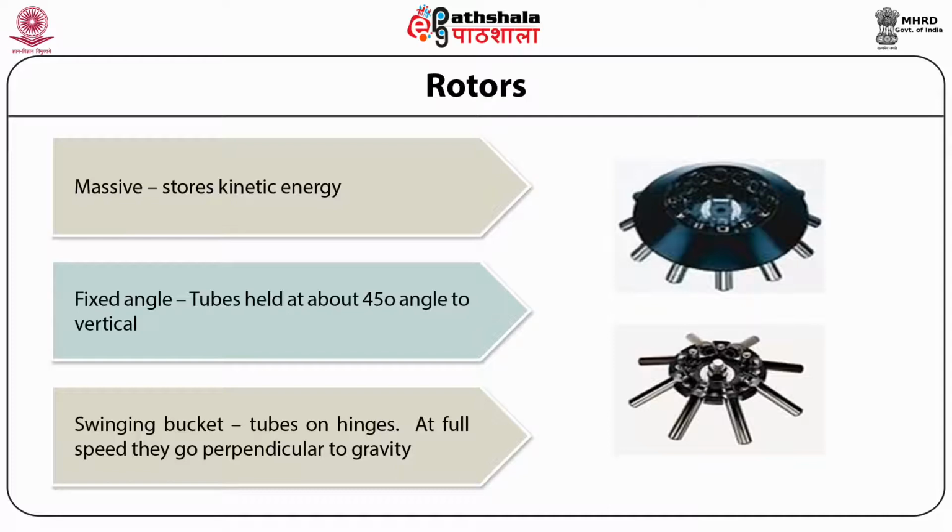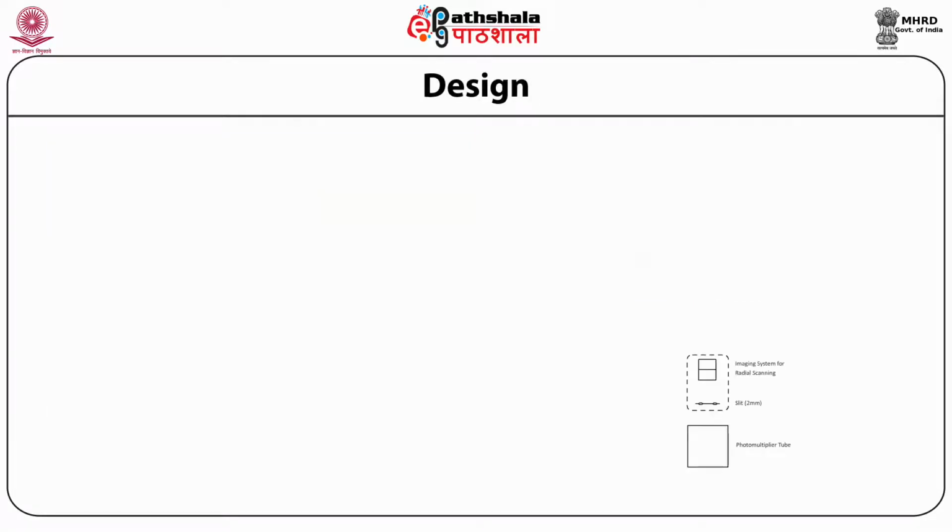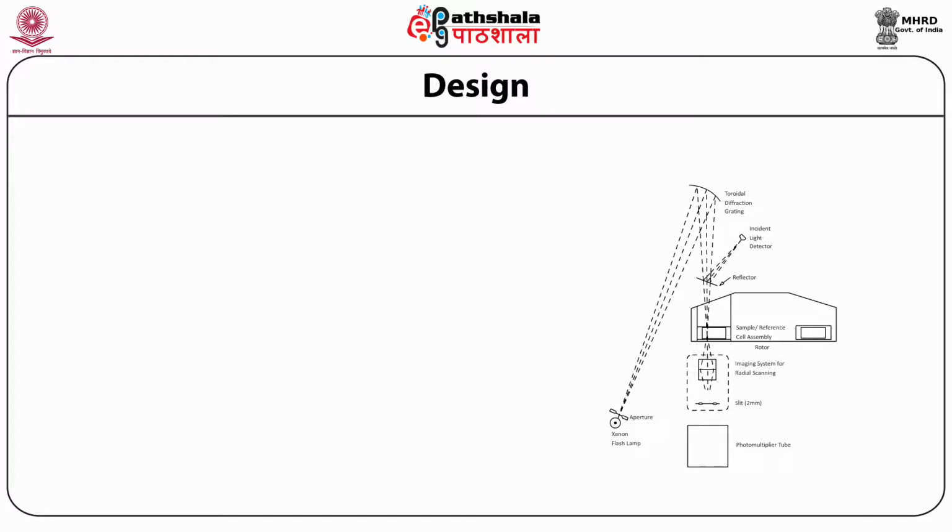There is another rotor known as the zonal rotor, designed for holding a sample of greater volume instead of multiple sample tubes. Apart from these multi-sample rotors, a self-locking mechanism is yet another important feature for some rotors, making rotor installation trouble-free and working safer. So these are the few important points that should be known about the rotors of ultracentrifugation. Now we will discuss the design of this ultracentrifuge.